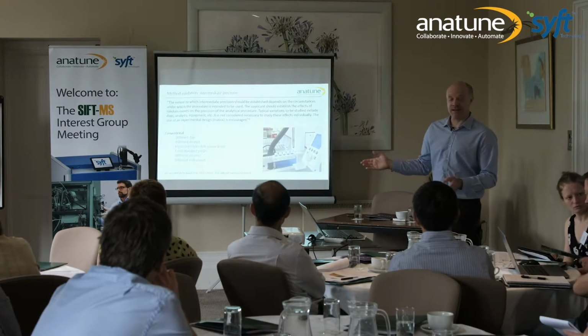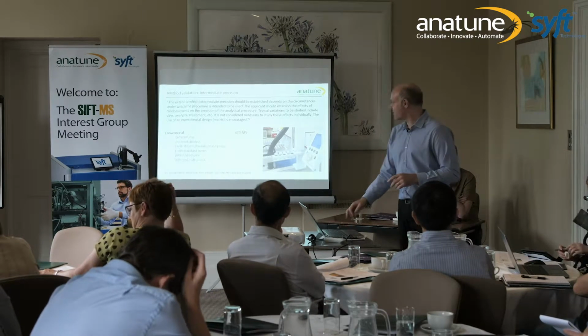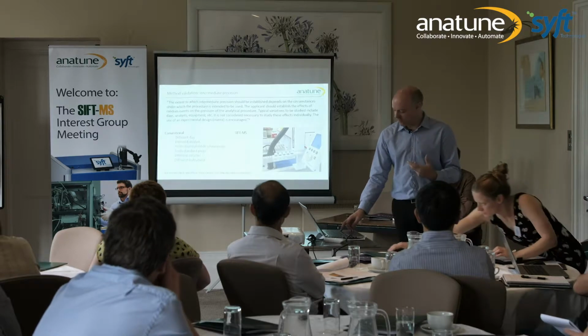Different instrument ideally. Now Joe would have loved to have done this on a different instrument, but he only had one in the lab. I'd have liked him to have two in the lab, but he only had one. So basically, he used a different analyst, different day, different sample prep, but the same instrument. But nonetheless, it's a different prep here.